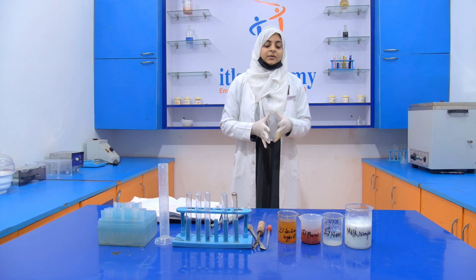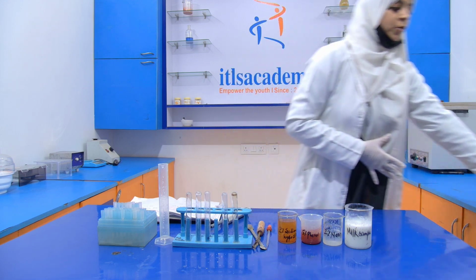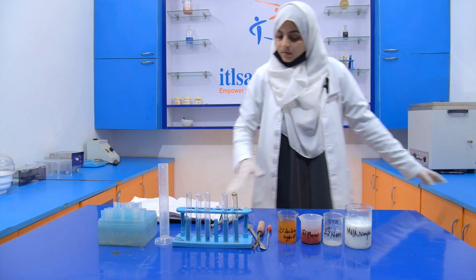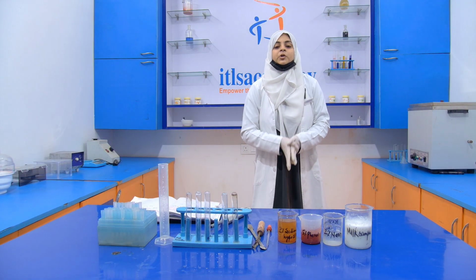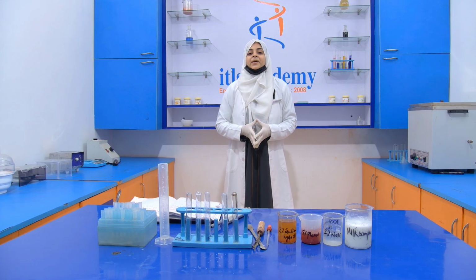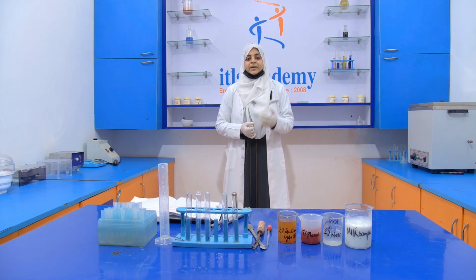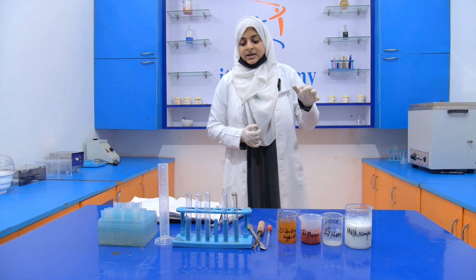First of all, for the preparation of the sodium hydroxide solution, we require 2 gram of sodium hydroxide, which will be dissolved in 100 ml of distilled water. Here we prepare it for 25 ml. So we take 0.5 gram of sodium hydroxide and dissolve it in 25 ml of distilled water.